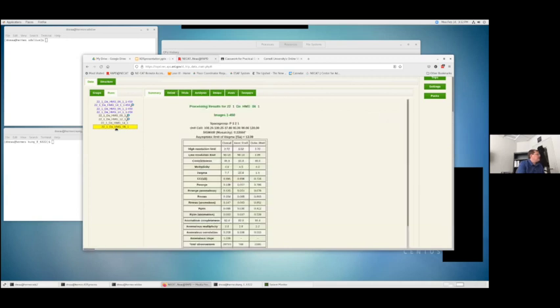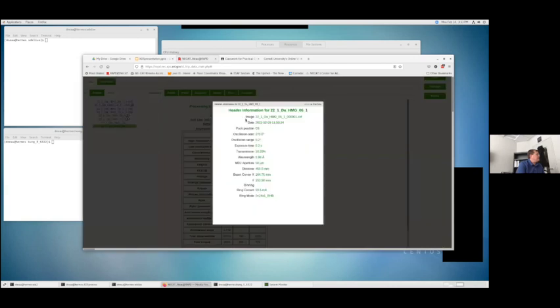if you right click on the name, you see it has the option to view, and then it pops up header. And if I click on that, it will give me information about the image file name, when it was collected, and various parameters of the data collection.